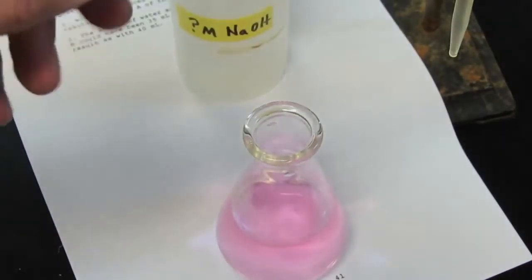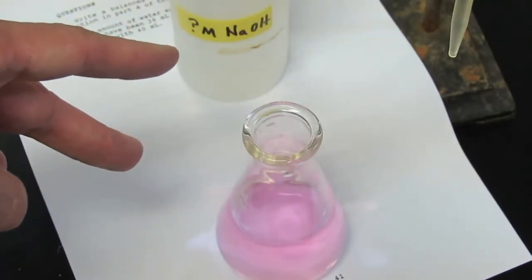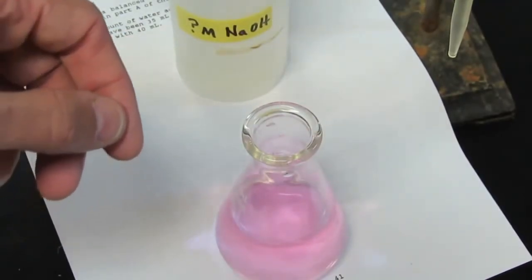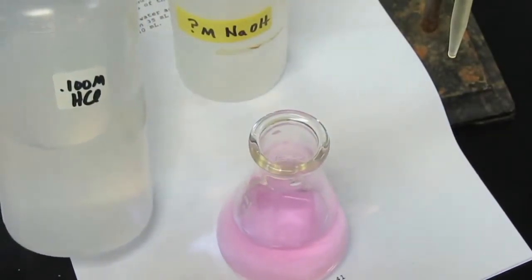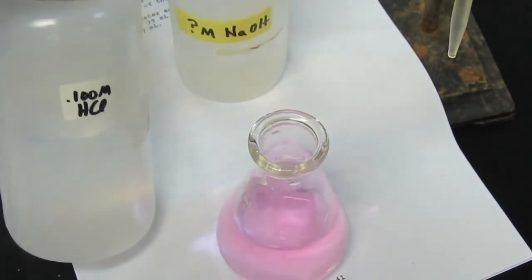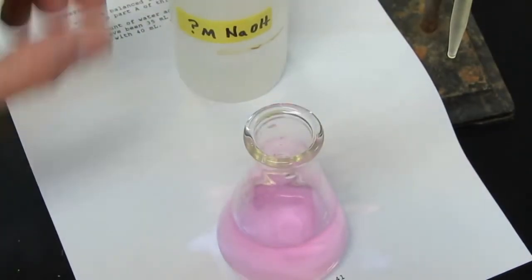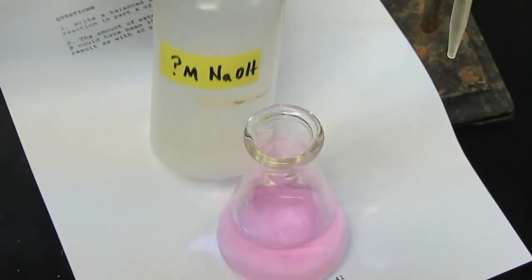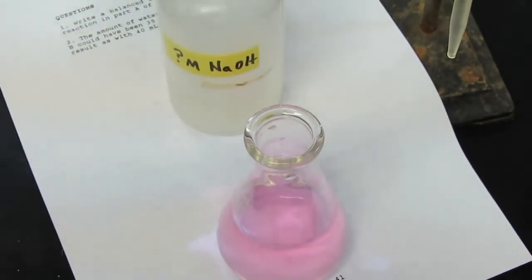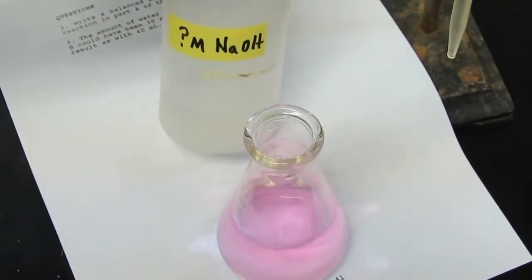Think about this. You know the initial and the final base reading. So you know the volume of base that was required. And you know the initial and the final acid volume. So you know the volume of acid that was used and its molarity. So with that information, you should be able to calculate the molarity of your sodium hydroxide solution. We call this process standardization. And in your experiment, you'll be required to do this 3 times and take an average.